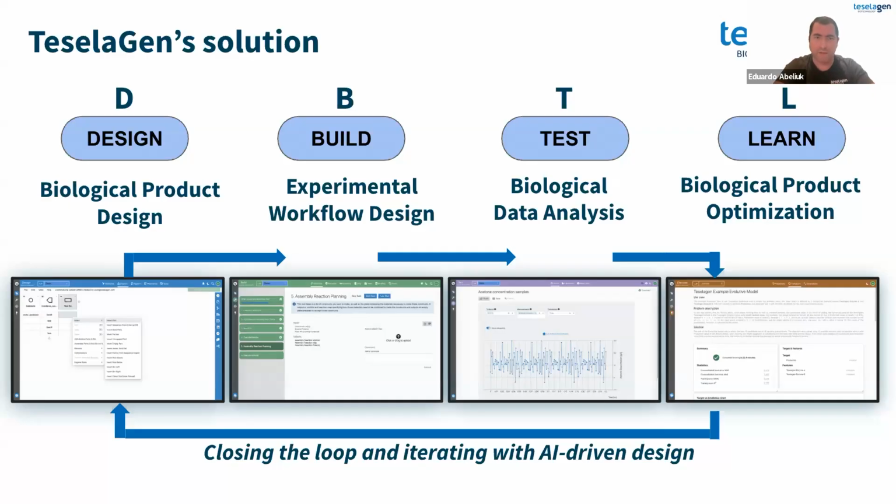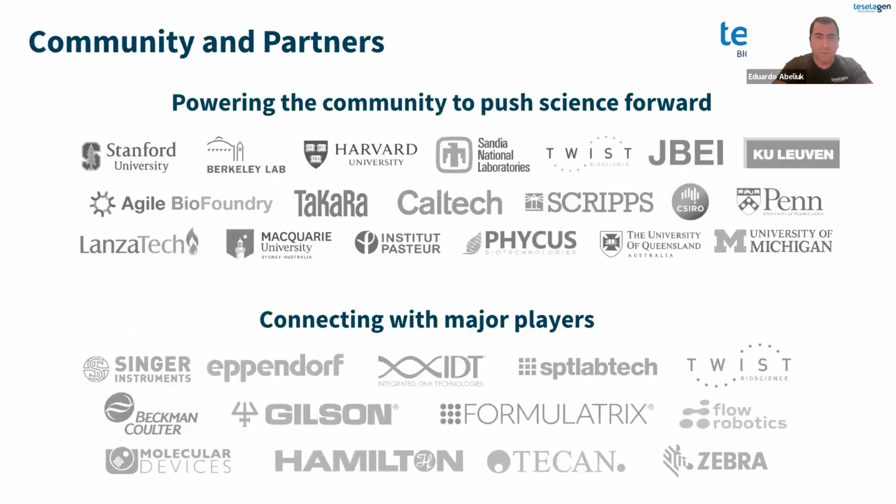in which our mission as a company is to empower scientists like you to not only implement the DBTL cycle, but hopefully to close it, because that's where the real power lies: capturing the knowledge from each iteration, learning from what worked and what did not, and using those insights to guide smarter designs, better experiments, and ultimately better products.